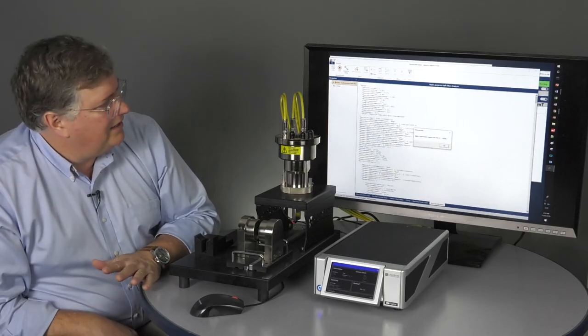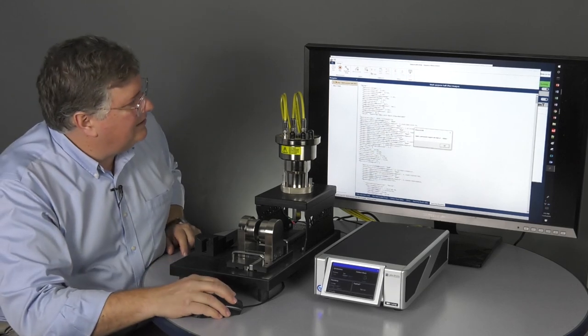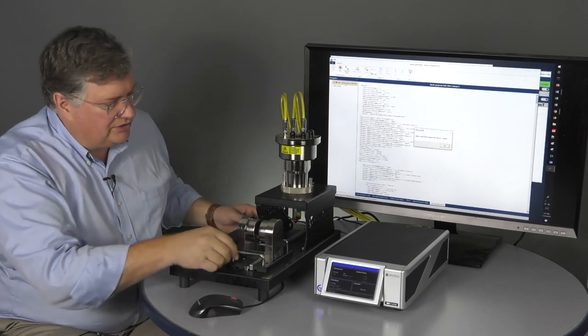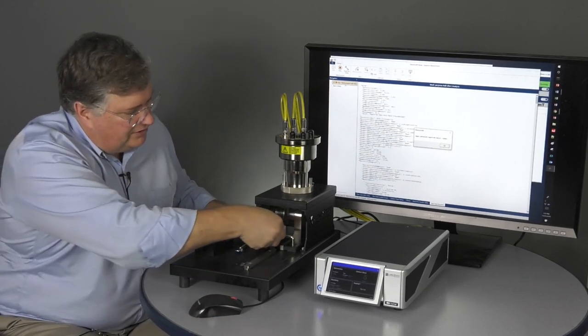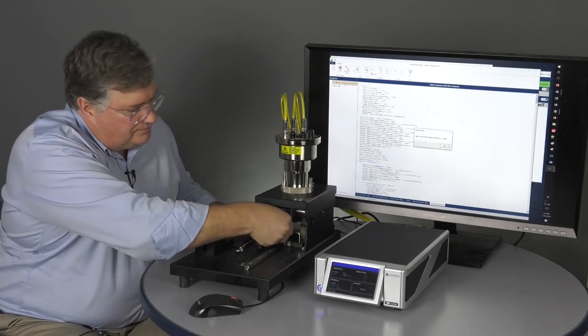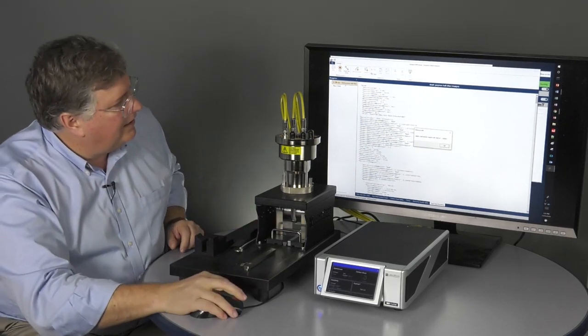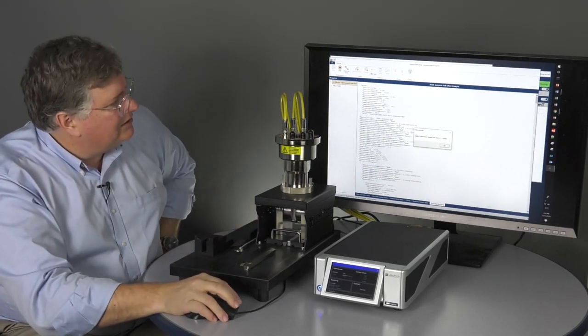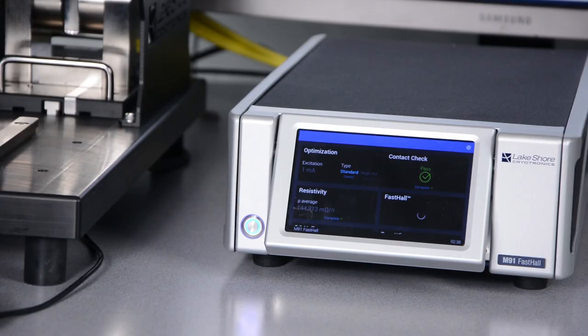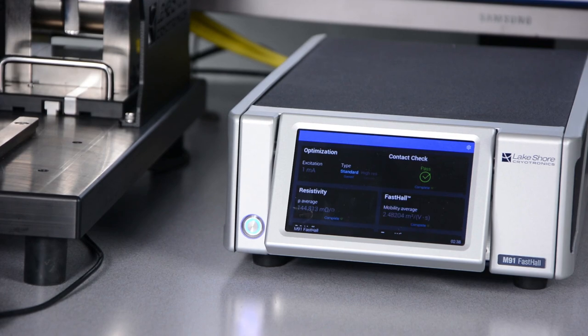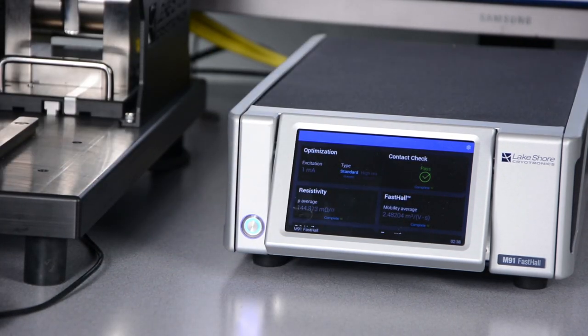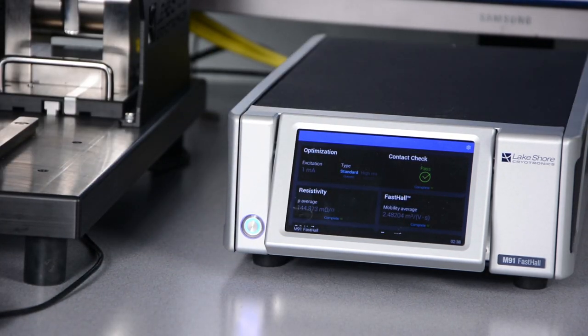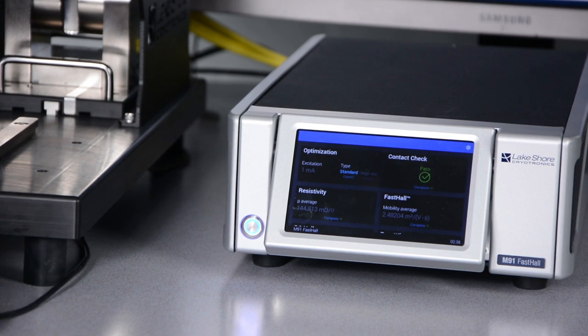So that's all completed now. The window here says that I need to switch the magnet into the position. So, there's my magnet now in position at a 1 Tesla value. Hit OK. And it will now do the fast hall measurement, which happens very, very quickly.